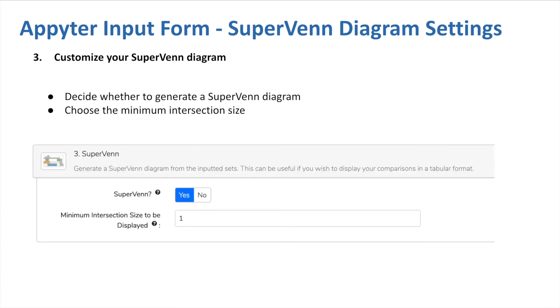For the super Venn diagram, users just have to decide whether they want to produce a super Venn and the minimum intersection size to be displayed. We saw earlier that when there are a lot of overlaps, the figure can become very cluttered, so we can increase the minimum intersection size so that any intersection value below this number won't be displayed in the bottom row of the figure.